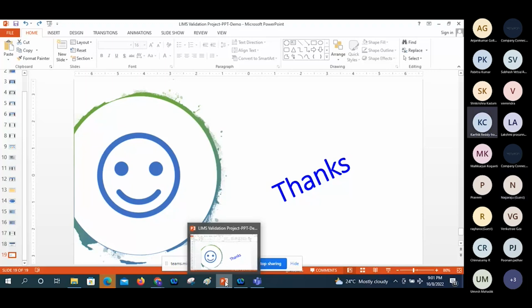Whatever the system we deliver to the end user, the end user is using it. Nearly 1 month, 2 months, or 5 months, 6 months pass, and the regulatory auditors visit the organization. For example, they want to verify one working standard: how the working standard qualification was performed in the laboratory. So they check whether the working standard has been registered.